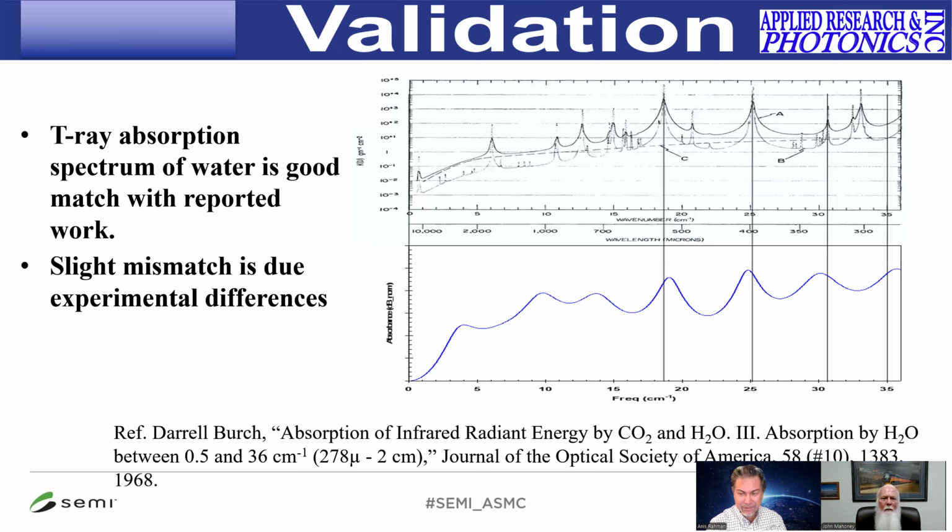The difference should be there, and that's what we have. So even something as, quote, simple as a water molecule in a different state, the T-ray has the sensitivity to pick that up. Exactly right. And the whole spectrum is way more complicated, so I'm not bringing it here.